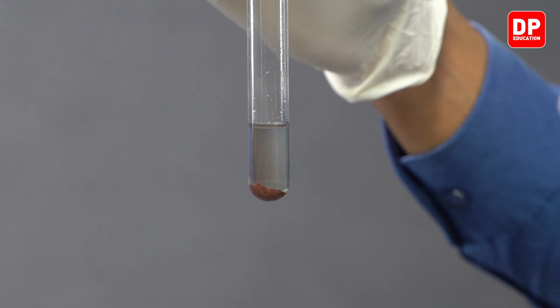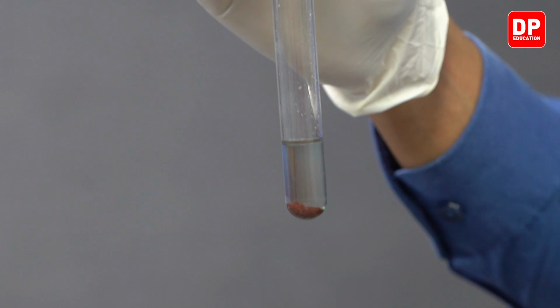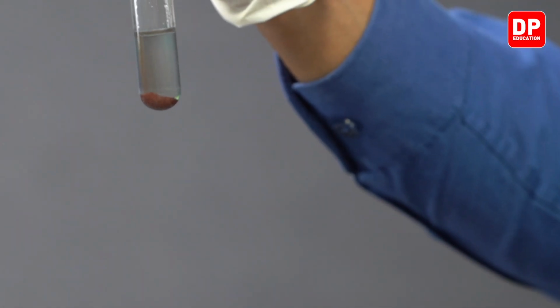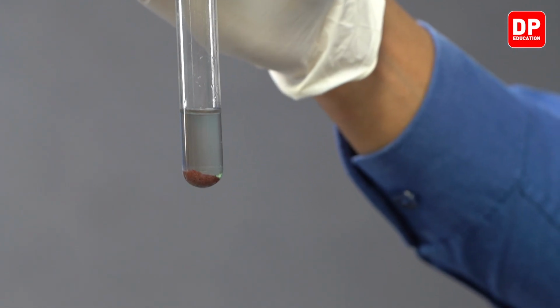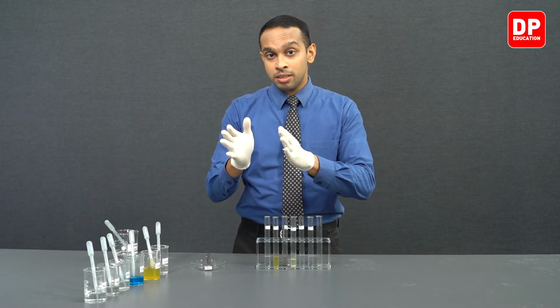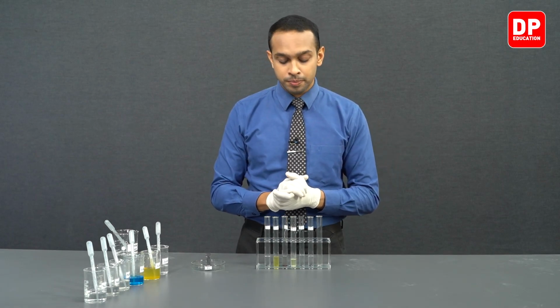iron that we added to the medium oxidized to form Fe2 plus. So what we have over here is a displacement reaction taking place in the presence of solid iron. So as iron gets oxidized, the copper gets reduced to form copper solid.